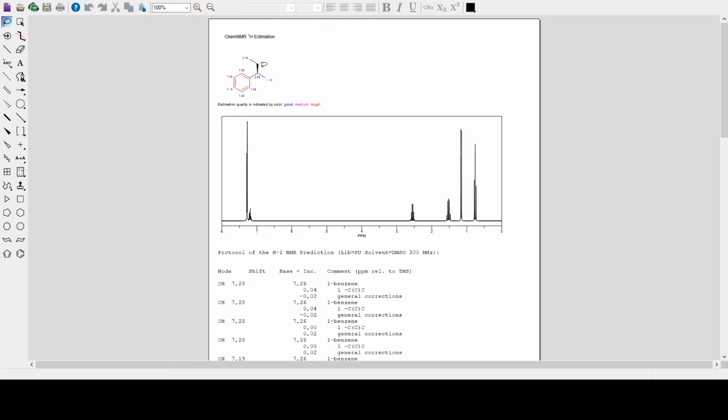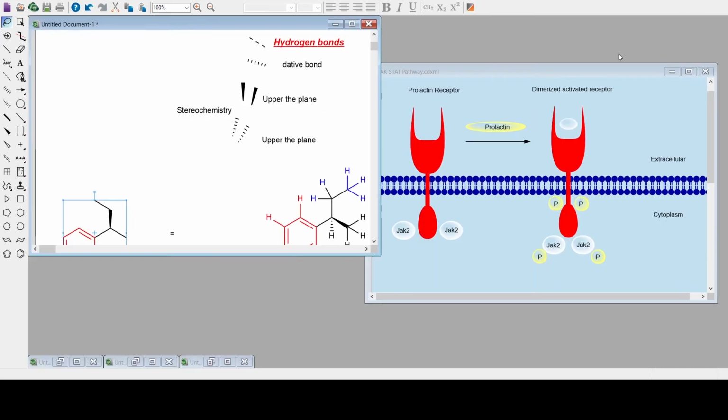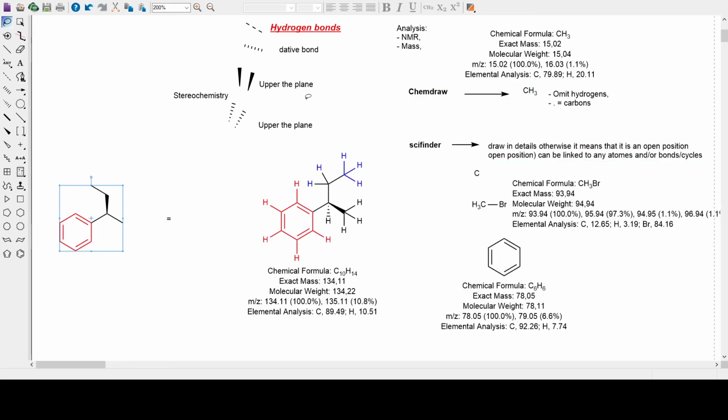Now you have the NMR. The NMR is the chemical structure, a fingerprint of your compound. Each compound has one fingerprint. But I don't know why it's not showing. If you want the name, you can go to structure. It's similar here. Text, curve.